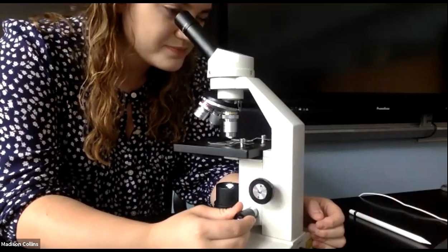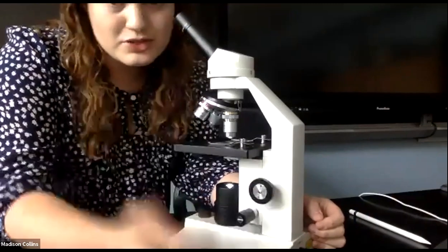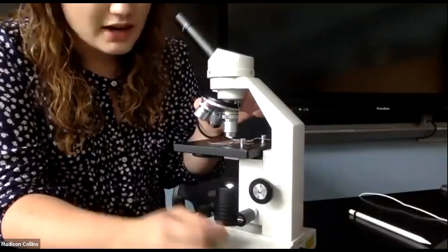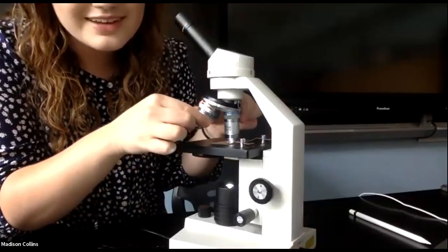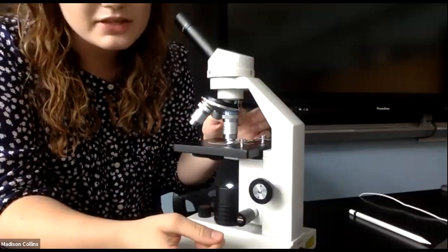So you're able to see the smaller details by using this fine focus and getting it as clear as it possibly can be. So now that I've perfectly focused my image, which unfortunately you can't see, if I want to view it any closer, I'm just going to turn this revolving nose piece and then wait until I hear that click. That means the high power objective is then being used.